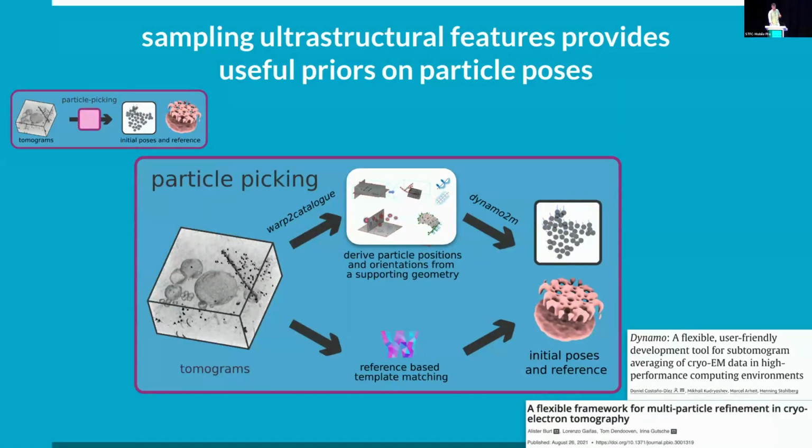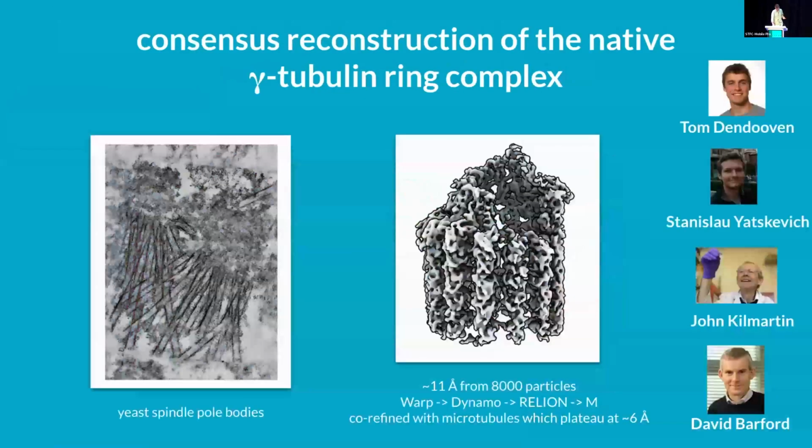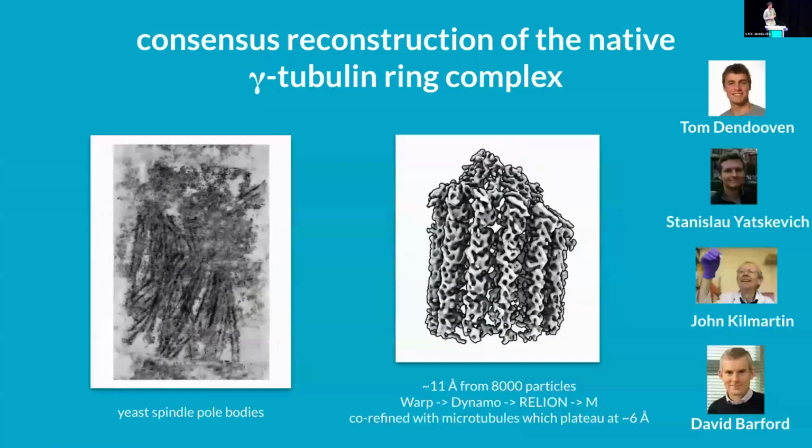I think this is really important. If you have prior information, you should definitely be using it. Maybe you need to do something a bit custom to get to that good set of particles.